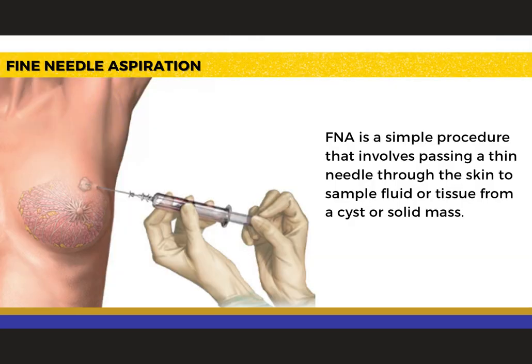Moving forward to fine needle aspiration, which is a type of procedure that we do for specimen collection. FNA is the simplest and least invasive test or procedure, and this one uses the smallest needle to simply remove cells from the area of abnormality. Please take note that this is not always adequate to obtain a diagnosis, depending on the area to be biopsied.